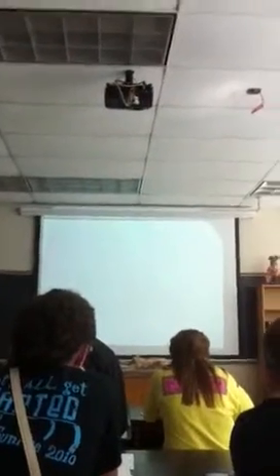That wasn't it. Someone said it was a good slide, but here, let me grab the slide from out on the scope. Or I can try this one. How about this one? Give this one a shot. This one's going to be purple in color instead of pink, but it's still going to look the same in terms of texture.